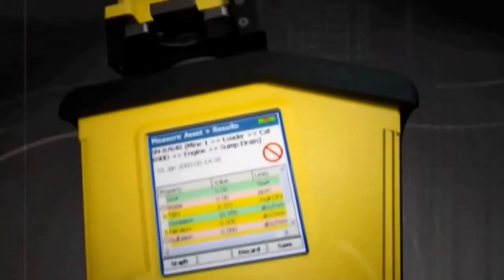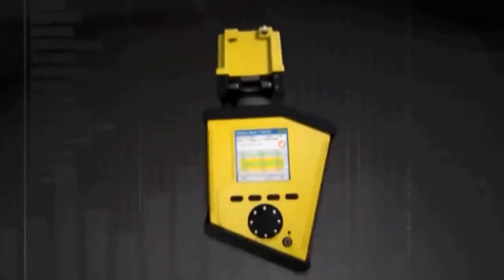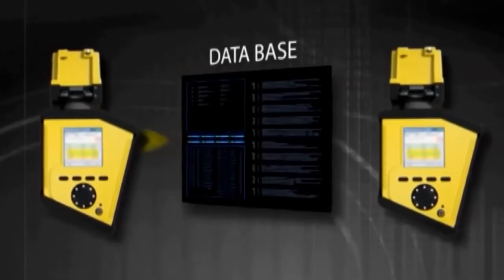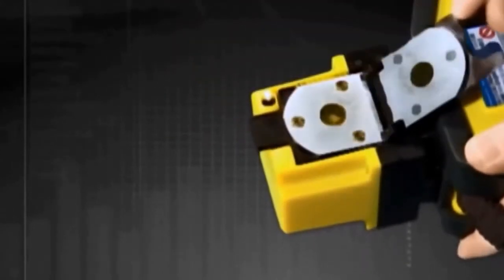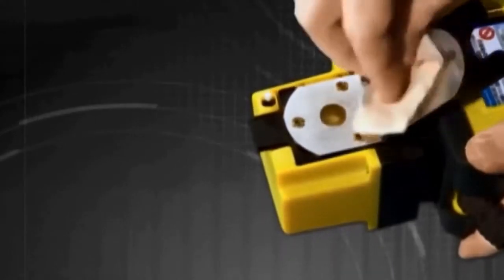The dispersing light from the grating is then channeled via the waveguide to a detector array that records the intensity and frequency of the spectrum. Sample results are shown on an LCD display and are stored in memory for trending or downloading to a central database. The cell is then cleaned by simply wiping it with a non-abrasive cloth, and the FluidScan is ready for its next sample. Note that no hazardous cleaning solutions are required.